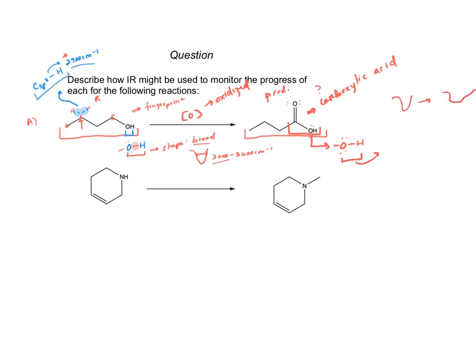It's super ugly in the IR spectrum, that OH bond particularly. So we're going to get an even broader signal, between 2200 and 3600 inverse centimeters, for specifically this OH of the COOH.